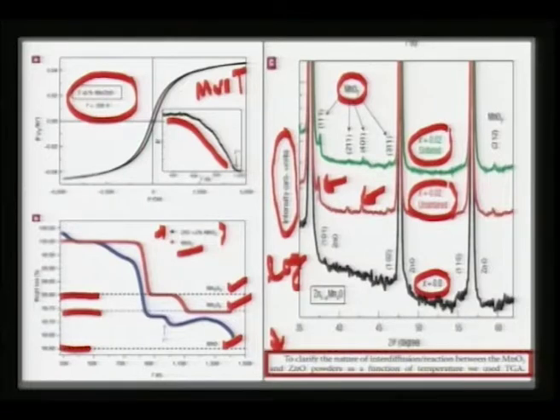Therefore, as a thumb rule, when we work with polycrystalline samples or bulk samples or even with thin film samples, it is a cardinal rule to look at the log intensity plot of X-ray, because the log intensity plot will bring these small features to prominence, mainly because relative to the intense peak of ZnO in a linear intensity plot, you would certainly miss out on these signatures, and this was the first clue that made the other group believe that probably manganese is not getting doped in the ZnO lattice.